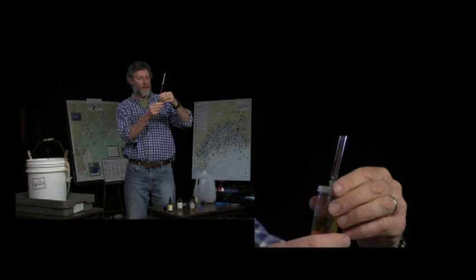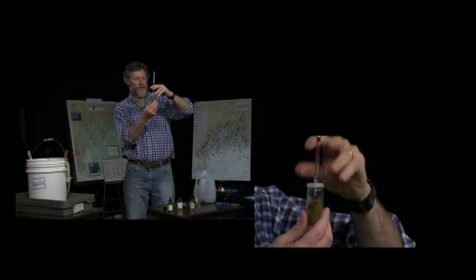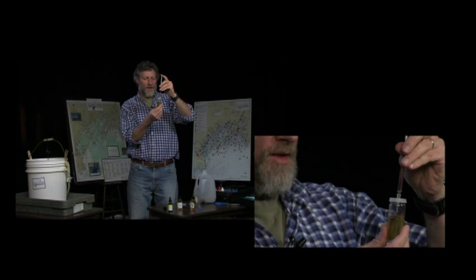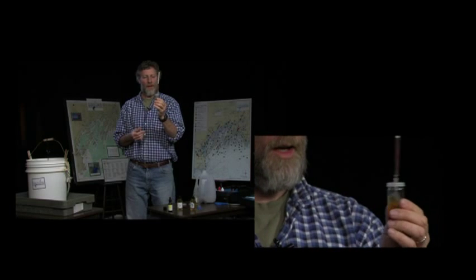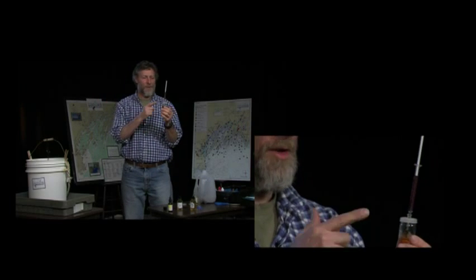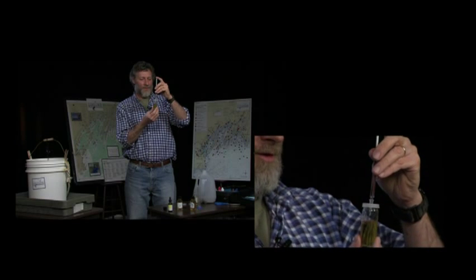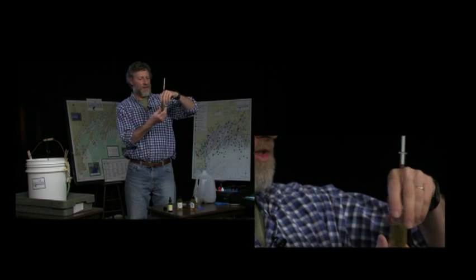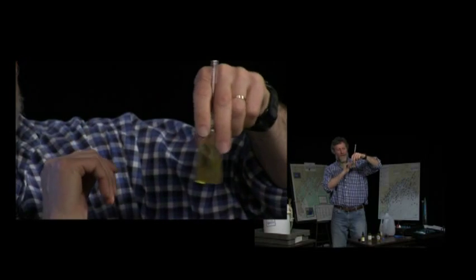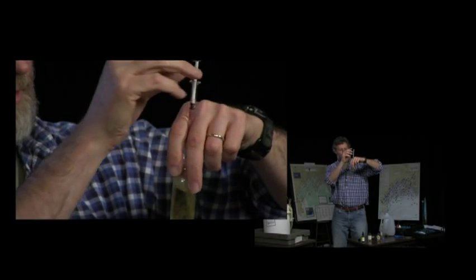And we're going to start by doing a little drop, and we'll give it a bit of a swirl. We'll give it a drop and a little bit of a swirl. One of the common mistakes when you do this is to swirl it around like this, and the syringe tends to be loose, and sometimes it can fly across the room. Some of these are glass, some of them are plastic. The glass ones tend to break, and then you're in trouble. So a good way to hold on to it is to clench over the top of the syringe like that, and then you can do a drop at a time. This is a good way to hold it because you're actually holding the syringe from flying out, and you can see what you're doing.